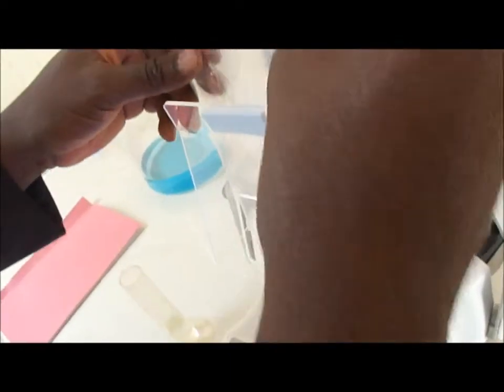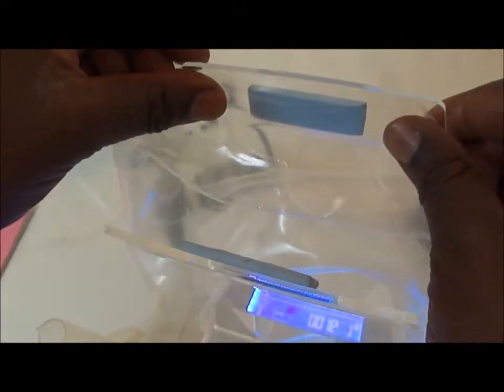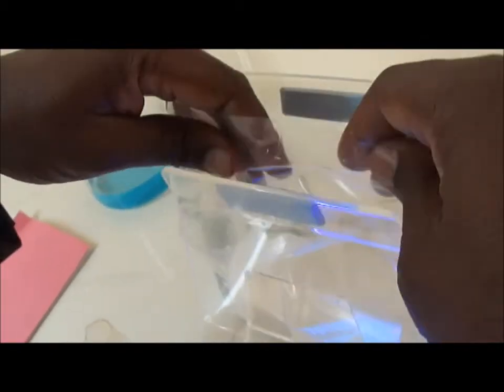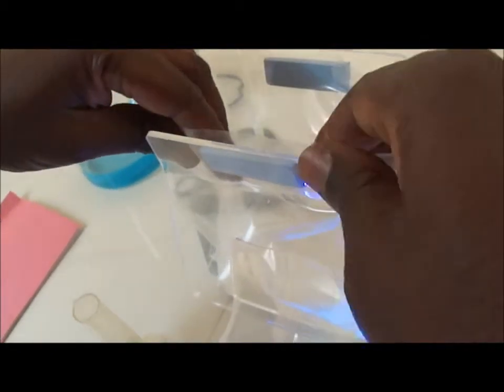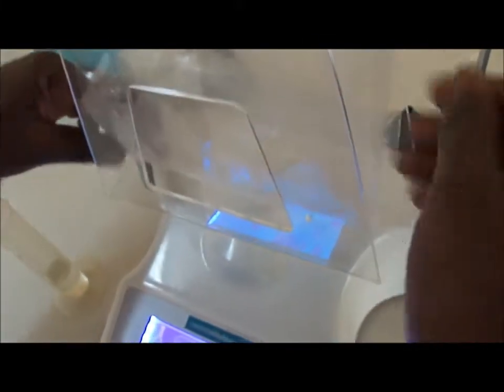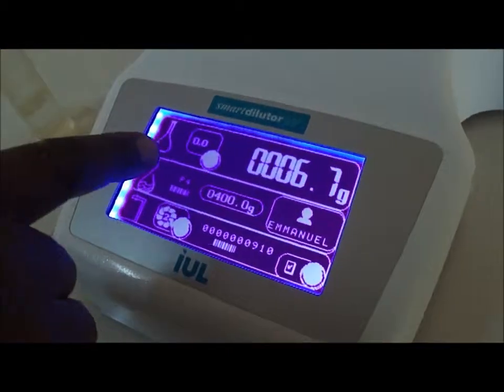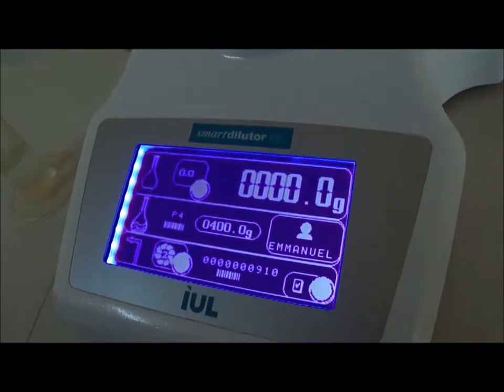The same way, we make the tare. So I put the bag and the weight is changing on the display. Then I will properly fix the opening of the bag by using the tape. And the bag is kept open at the top here. And carefully, I put the bottom of the bag on the support. You see the weight is different now. I make the tare by pressing this button.